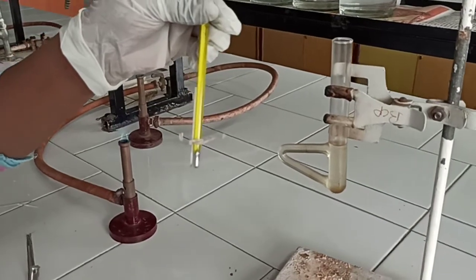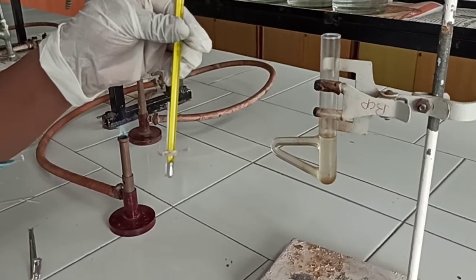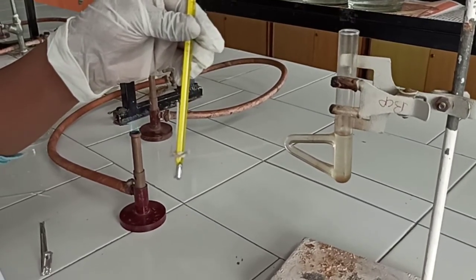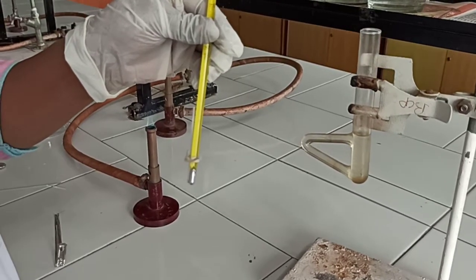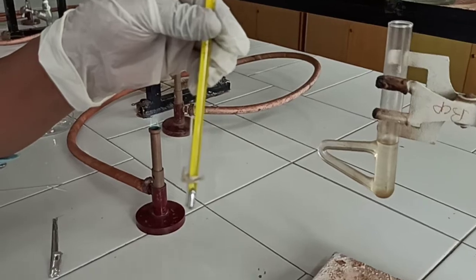Then, see the next step is that we have to tie the capillary tube containing the given sample of organic compound to the thermometer near its bulb with the help of thread or rubber ring.